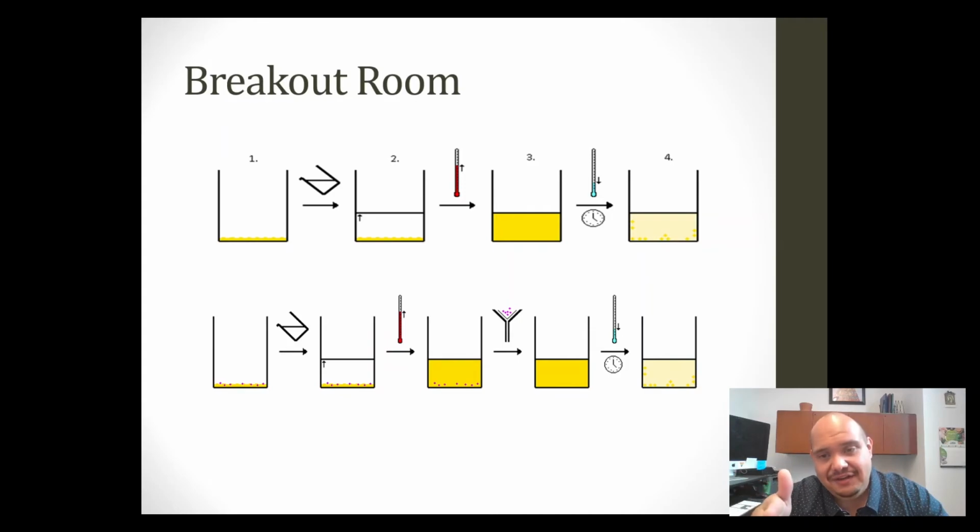You take that solvent and allow it to cool at room temperature, and slowly more of those crystal seeds are going to form. That'll be your second crop. You isolate that crop from the yellow solution, and then you have more of your crops of crystals. And I would actually keep these two crops of crystals separate.